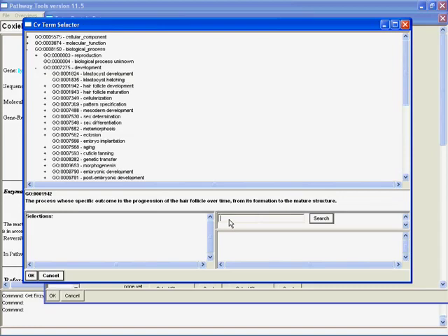And so, for example, I could type in aspartate kinase, and I could click search, and you have to click search. Hitting enter here, as you may be used to doing, won't work. And what the software is doing now for you, and it's done, is searching through the entire GO hierarchy for appropriate terms. And we see, aha, aspartate kinase activity.